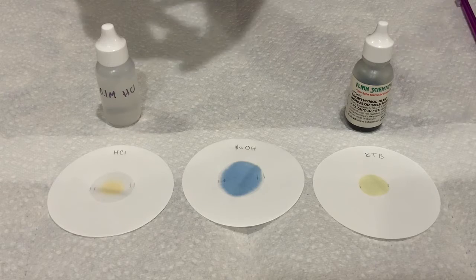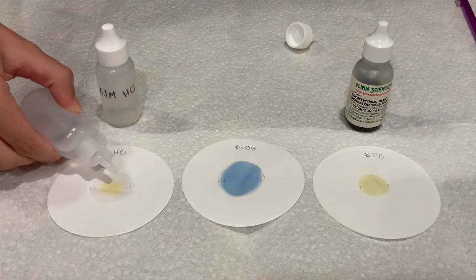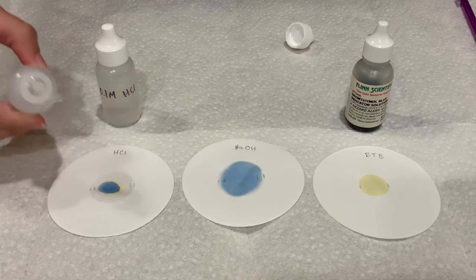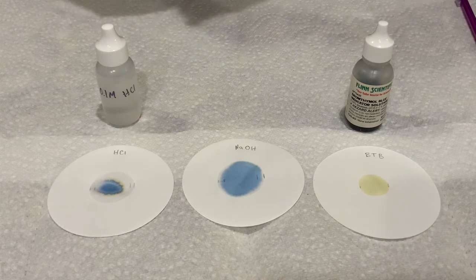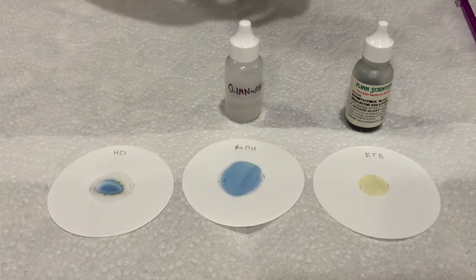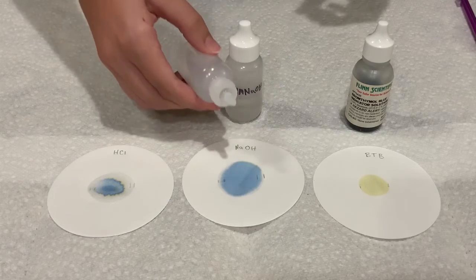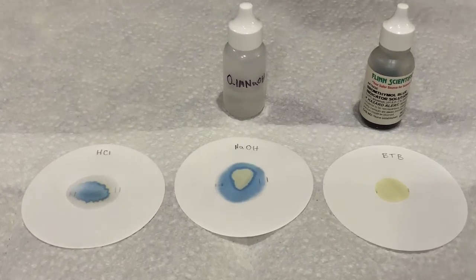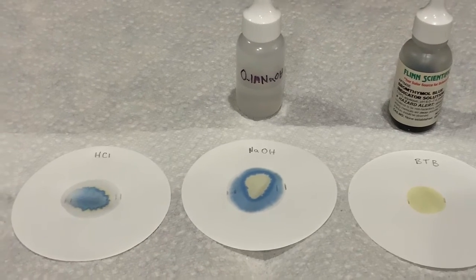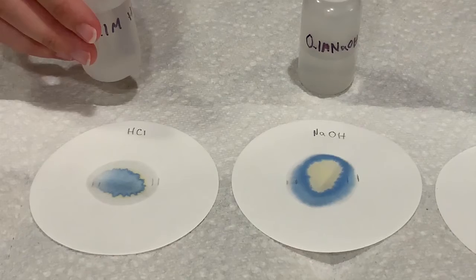All right, now the next thing we're going to do is put a drop of base in the acidic solution. And we're going to put a drop of acid in the middle of the base solution. Ooh. Pretty, huh?